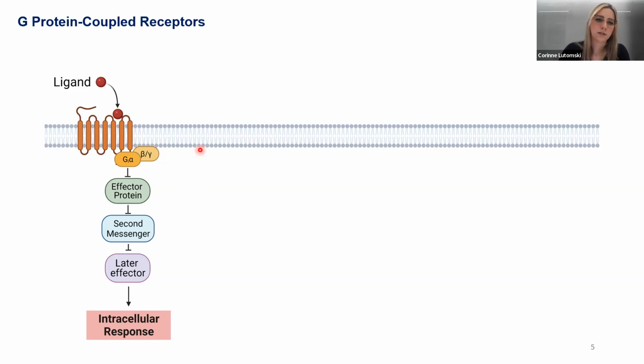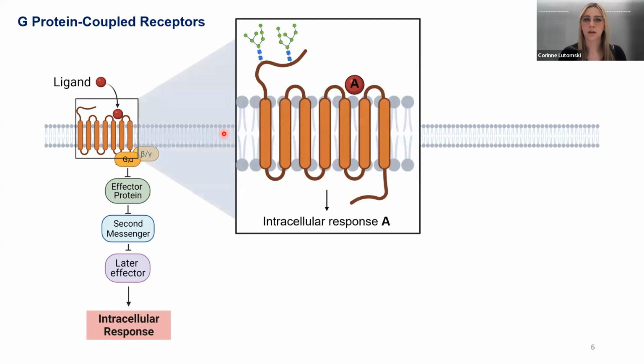And so there's a lot of interest and a lot of work that's been done on these protein networks, things that GPCRs interact with downstream, and it's quite well characterized what types of protein networks will give you a certain response. But something that's a little bit less characterized is the GPCR itself, or the proteoforms that contribute to that. And so this is just now a cartoon of you may have a GPCR.